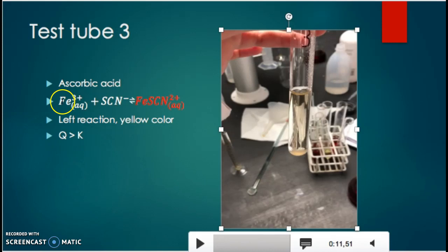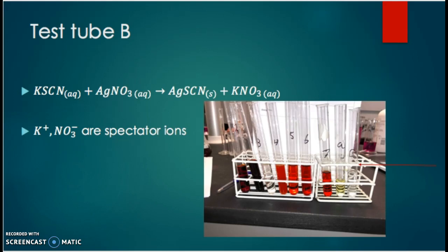Before test tube four, we made a small test in a test tube tagged B. We added potassium thiocyanate solution and added a couple of drops of silver nitrate. We observed a white precipitate, because silver thiocyanate formed a solid precipitate. Potassium and nitrate remain in aqueous solution — they act as spectator ions and have no impact on the reaction.